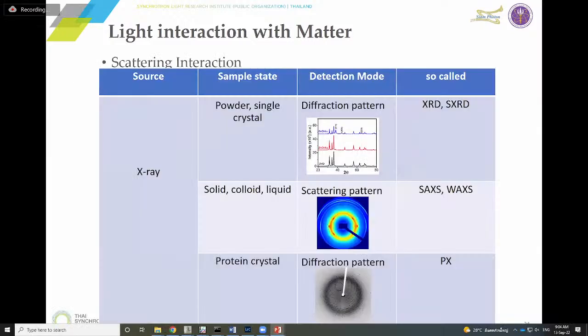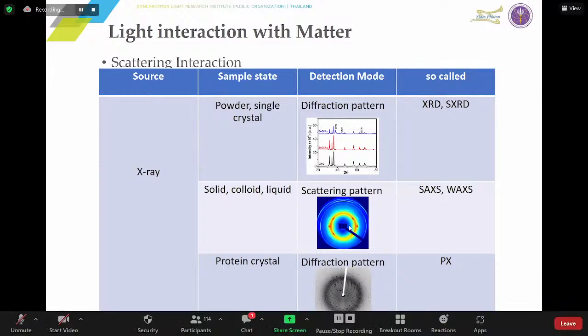These scattering patterns contain kinds of information, like you can get diffraction patterns. If you track the intensity in these radial directions, you can get the information like XRD, the X-ray diffraction, but it's 2D. So there's some kind of mathematical circular integral in this direction, and you get this graph. It's pretty much an XRD result. But if your sample is not very crystalline, you can get an asymmetric pattern. It's not the complete circular rings. You can get asymmetric patterns.